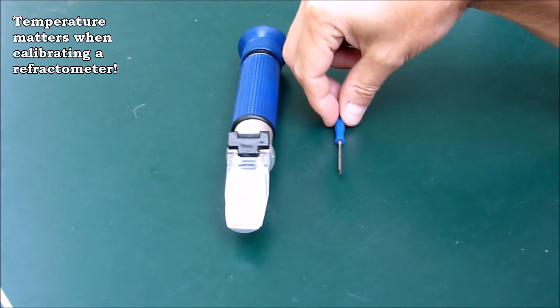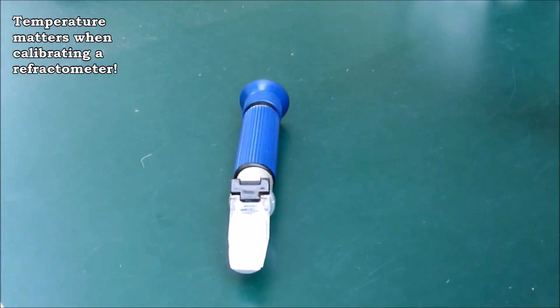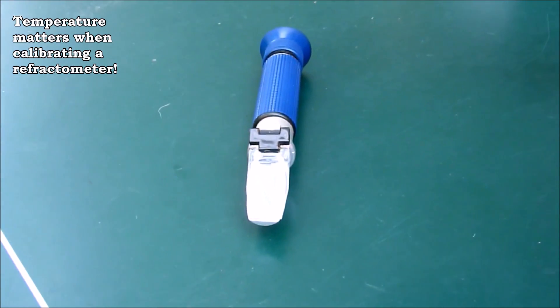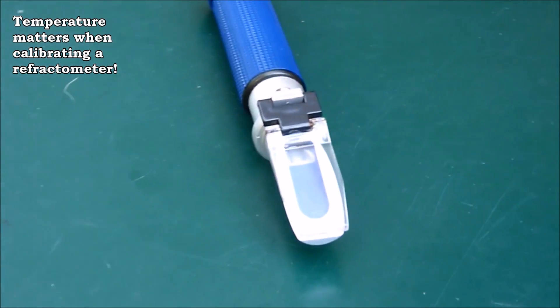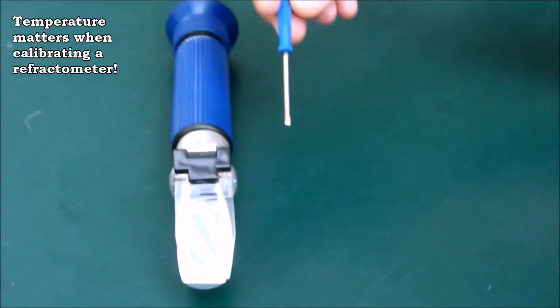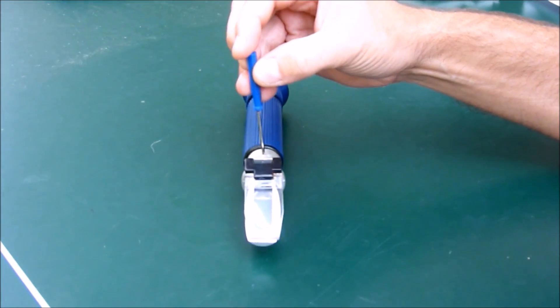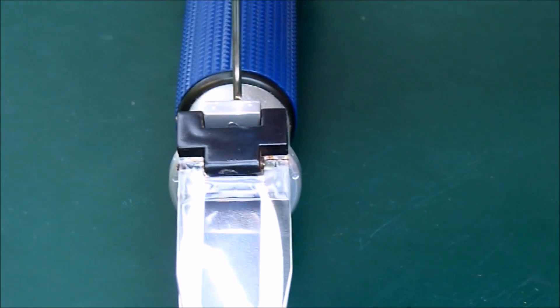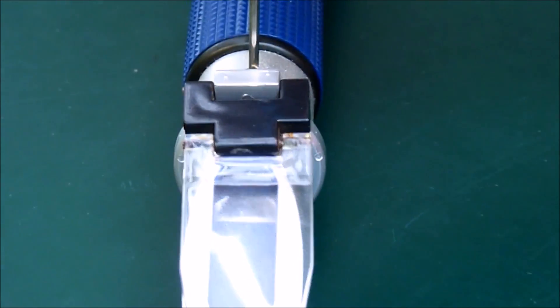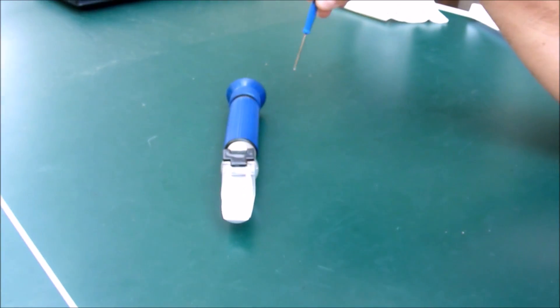So, the pros are accuracy. The only con to this tool is you have to calibrate it. And, when you calibrate it, it has to be accurate. Otherwise, every reading from that on will be wrong. So, you generally do that with distilled water. And, they give you a little tool. It's a small screwdriver here. And, you just turn this screw slightly based on the temperature and distilled water which has a reading of 1. And, you set it, you set that as your reference. And, from then on, you're good to go. You calibrate it periodically. Just make sure it's accurate.